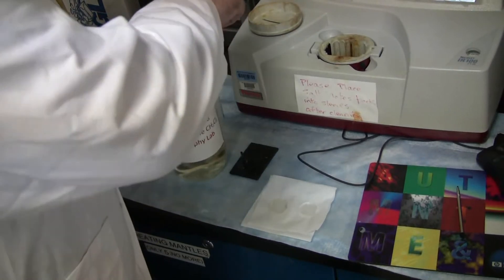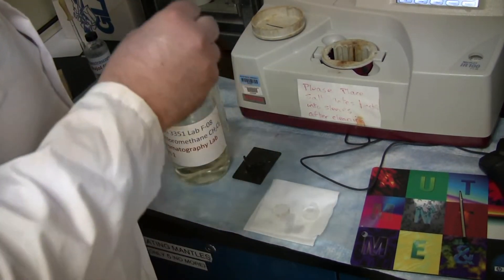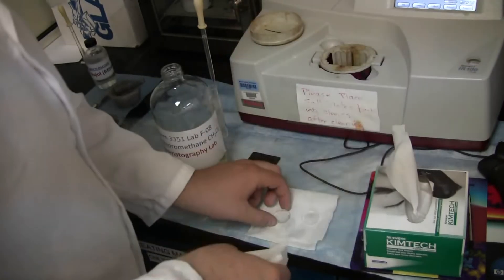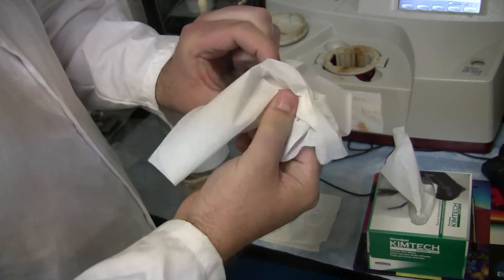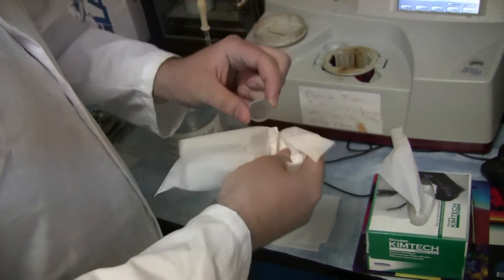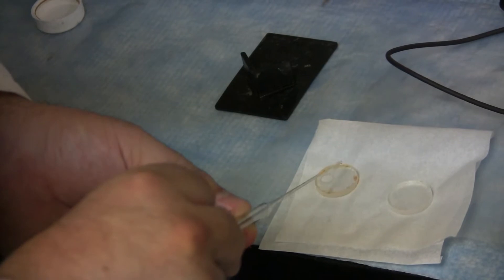Start off by placing dichloromethane across both salt plates. You will then need to take one or two Kim wipes and thoroughly scrub the surface of each salt plate. Once finished, take a drop of your sample and place it onto one of the salt plates.